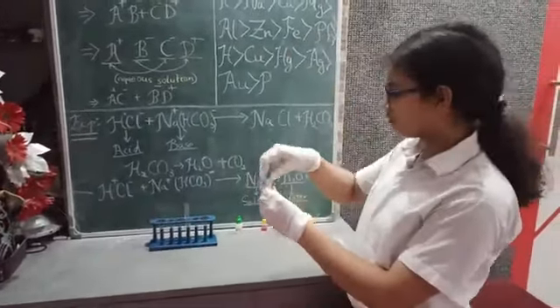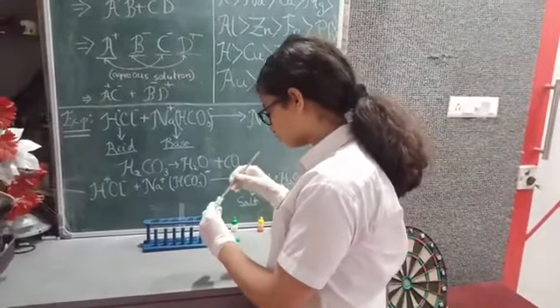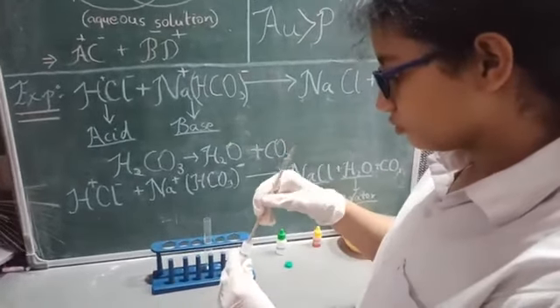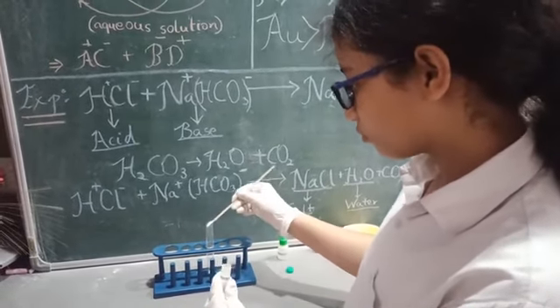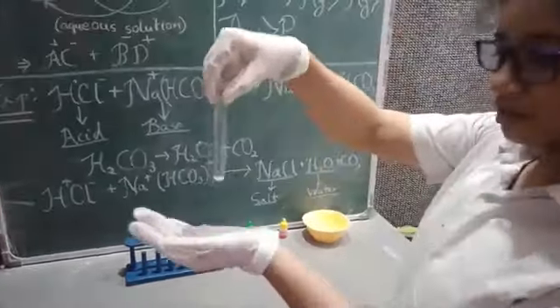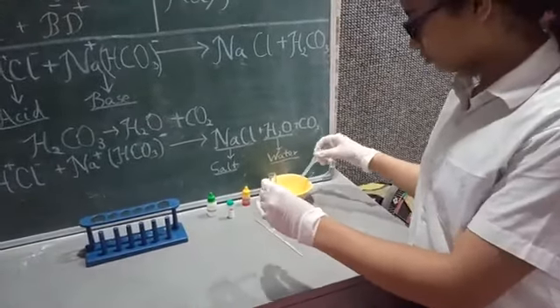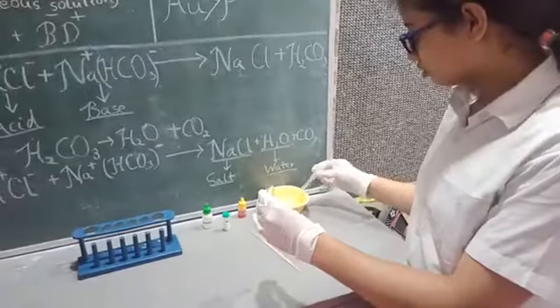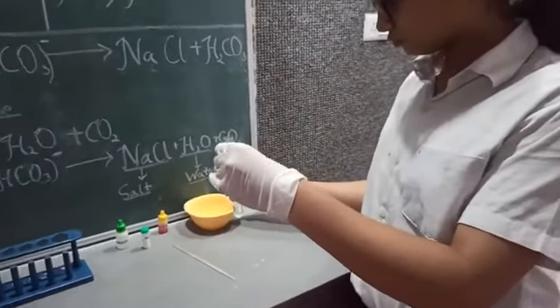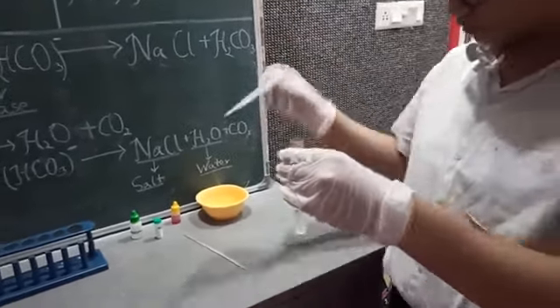So first I will add some base to test. One or two scoops are enough. As you can see over here, this much is enough for the experiment. And right now I will add some water so that it creates an aqueous solution. This much water is enough.